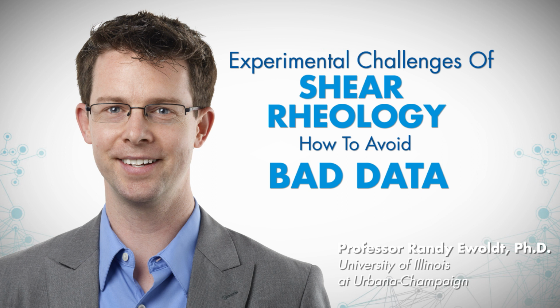Sure, thanks, Dave. That's a good question. And you're right, a lot of the examples I gave were water-based, very low viscosity things. For polymer melts, of course, any material is subject to the instrument limitations, things like low torque and high Reynolds number. But if you look at the flow curve, viscosity as a function of shear rate, going back a couple of slides, you might remember the viscosity versus shear rate curve. I mentioned this no man's land at very low viscosity that we can't achieve, but the higher your viscosity is, the wider that experimental range is.